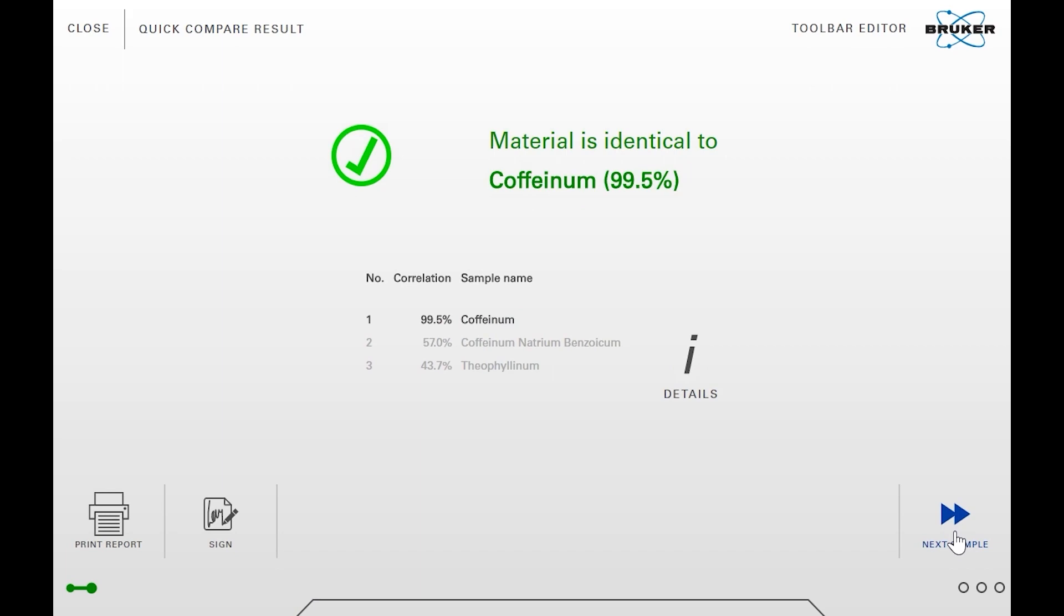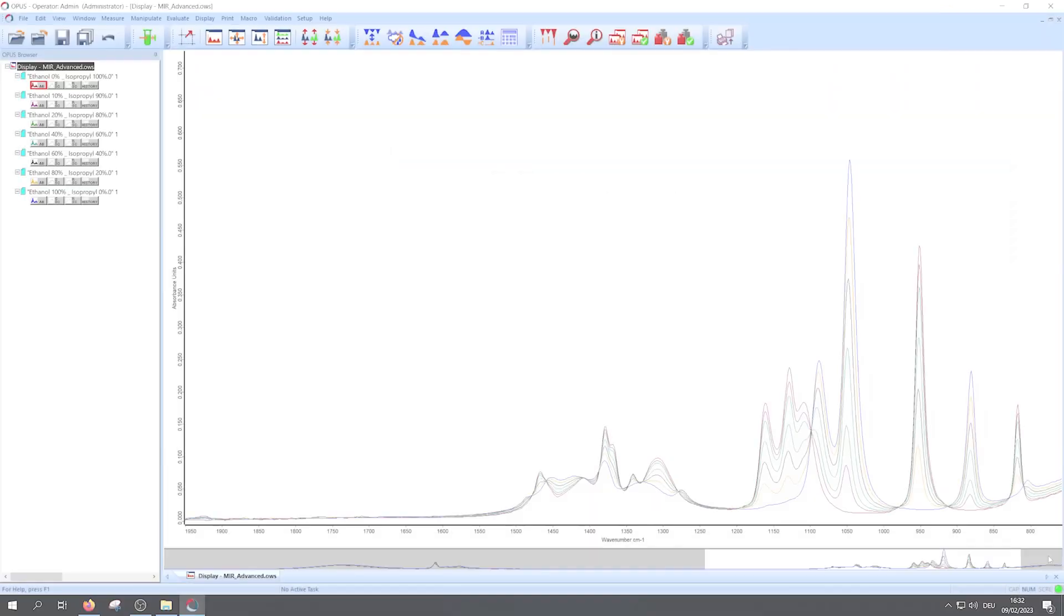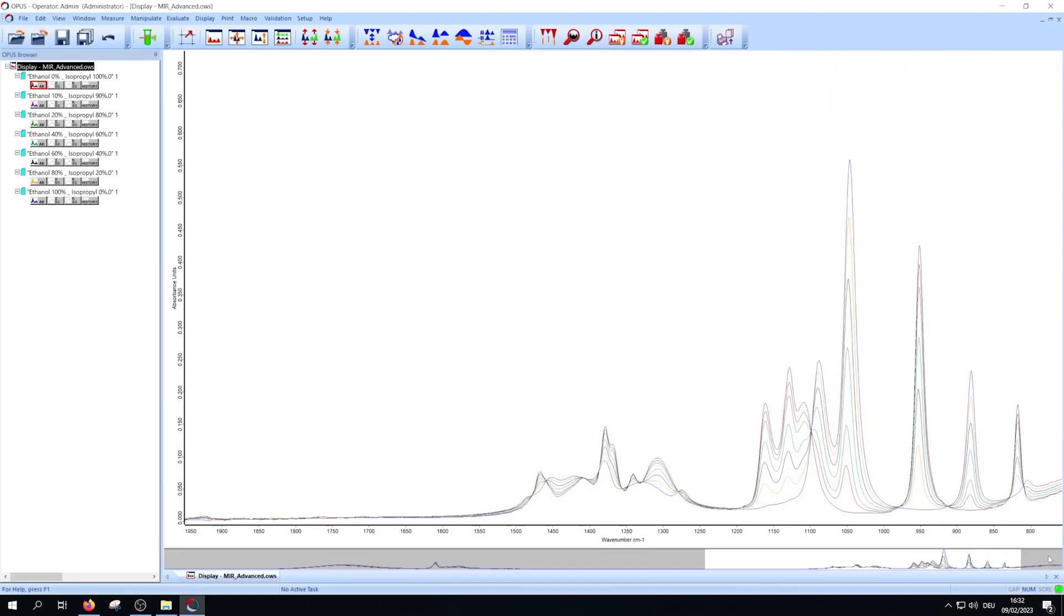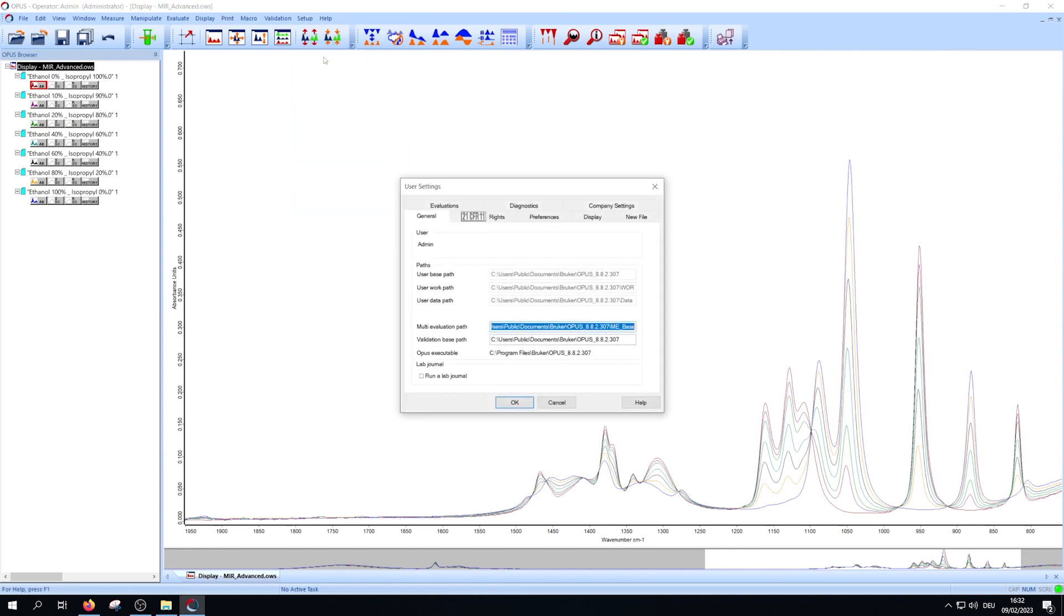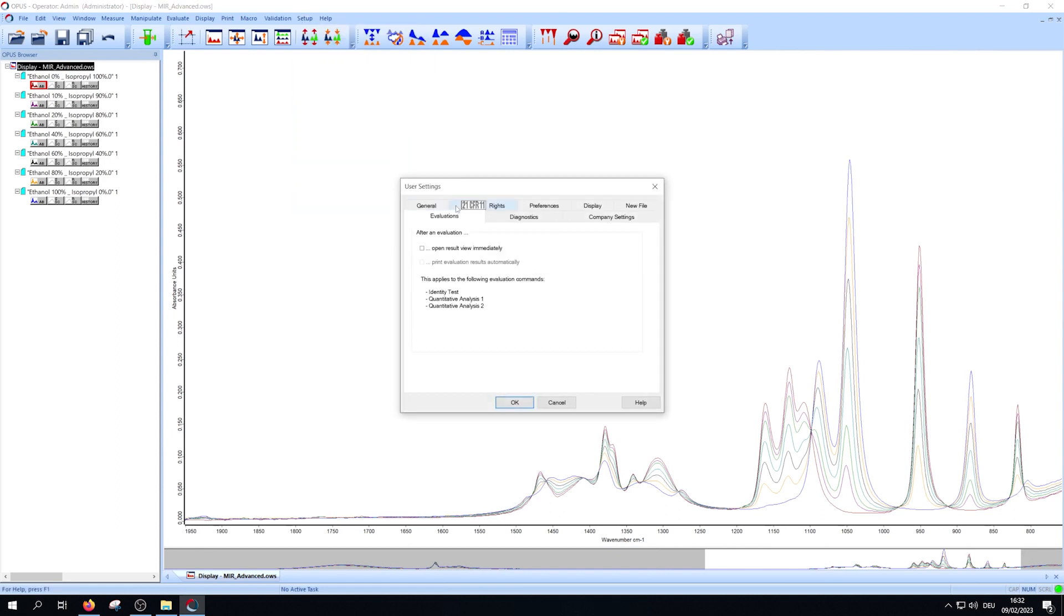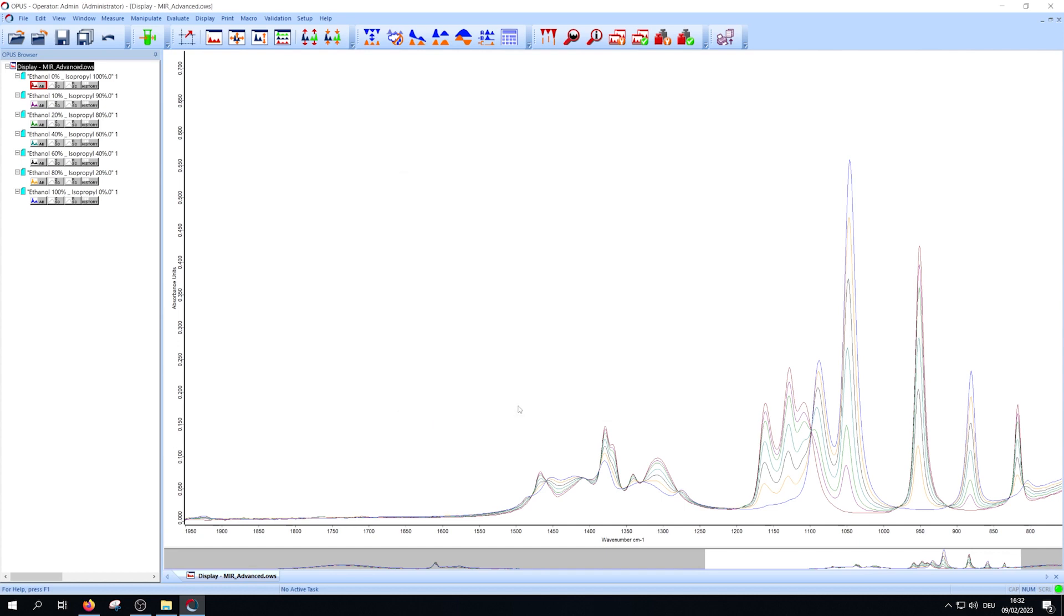But of course you can also perform the evaluation in Opus IR. Before using the quant method, check that under Setup, User Settings, in the Evaluations tab, the option Open Results View immediately is active.